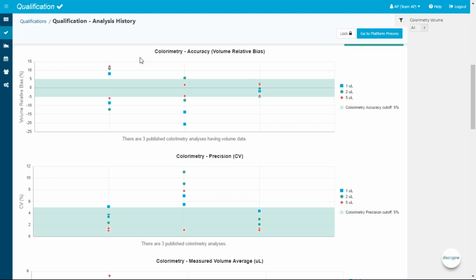So to make sure that things don't get worse, I decide to, 2 weeks after my January analysis, have a new analysis just to check if everything was okay. And when I ran this analysis, well, I noticed that the CV was completely off the chart.